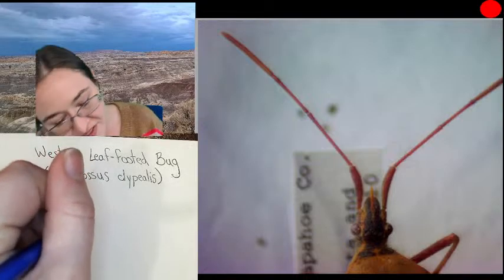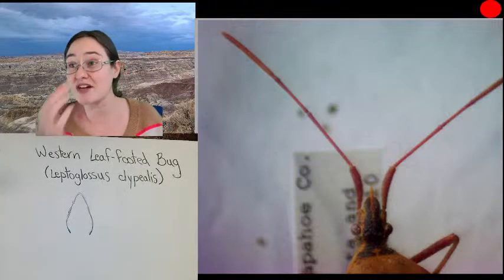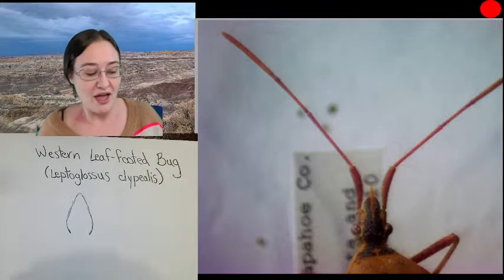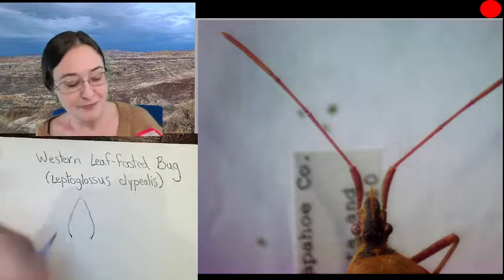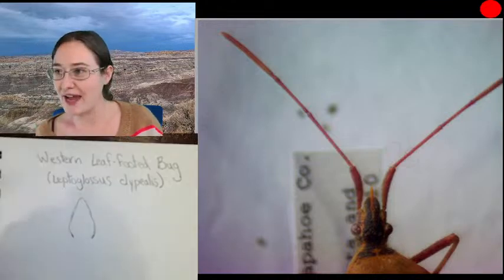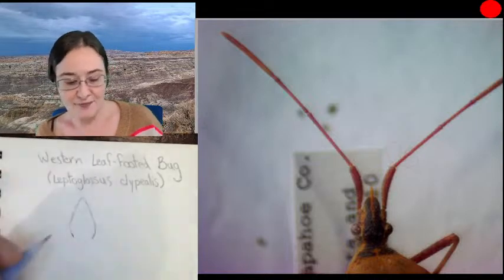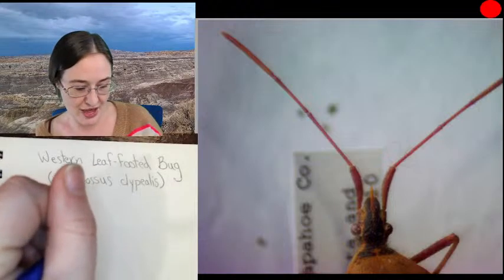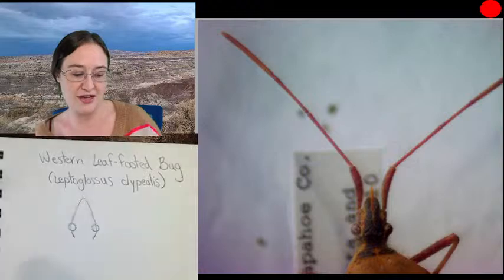always working off a center line, keeping in mind that insects are symmetrical, right? So you want to make sure that they're the same on the left and the right. And then after we've got kind of a basic shape, we can go in and add a couple of things. For instance, I want to make sure that he's got these eyes, and the eyes do come off of that shape just a little bit.